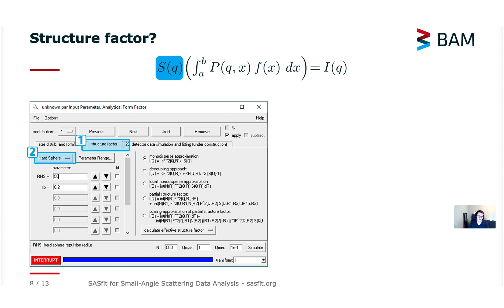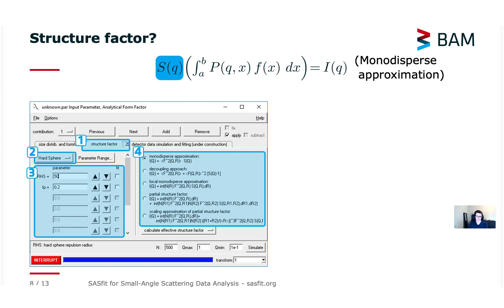In the next step you configure the actual values for the structure factor in the lower part. On the right side you select the way how to incorporate the structure factor. Here is the previously described monodisperse approximation selected under the point 4. And also the local monodisperse approximation can be recommended from time to time when it's important to couple the repulsion radius of the structure factor to the actual scatterer size.